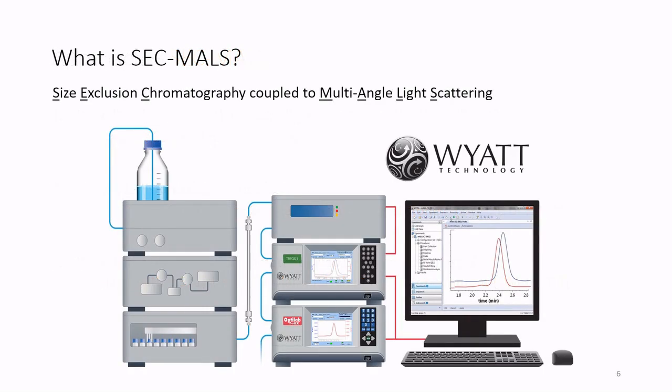So what is SEC-MALS? SEC-MALS is size exclusion chromatography coupled to multi-angle light scattering. It is composed of two major components, the SEC part, which is labeled in blue, and then the MALS component over here, which is in green and red. The SEC component is comprised of an HPLC pump that drives our proteins and buffer to the SEC column.